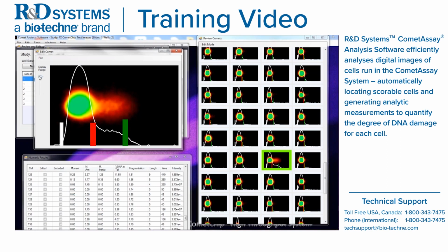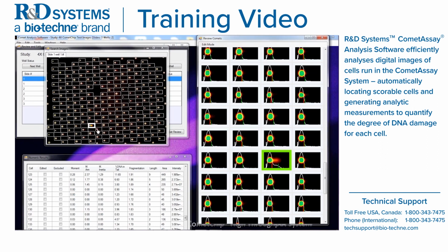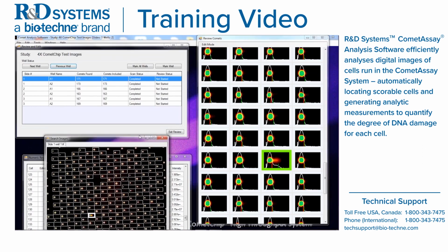You also have this display range, so you have a high level, or you can click down to a lower level. And you can click on the marker to see exactly where it's been positioned. Again, the only markers you can move when editing the comet are the start of the tail and the end of the tail. You cannot move this first position marker. So we'll get out of here. Like I mentioned, everything is pretty much a toggle.